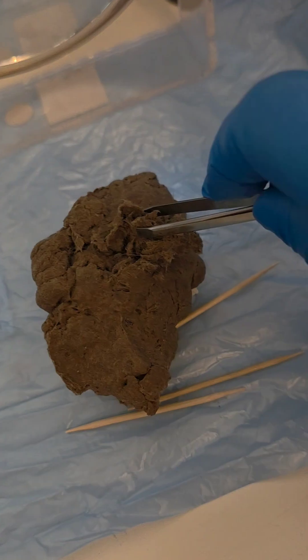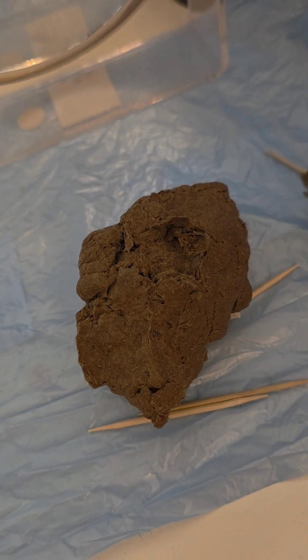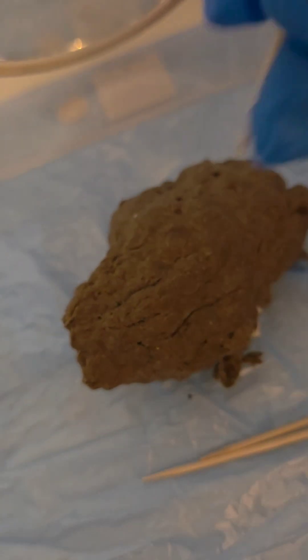Gently probe the pellet and discover what's inside. I wonder what you'll find. Can you see something sticking out? What could it be?